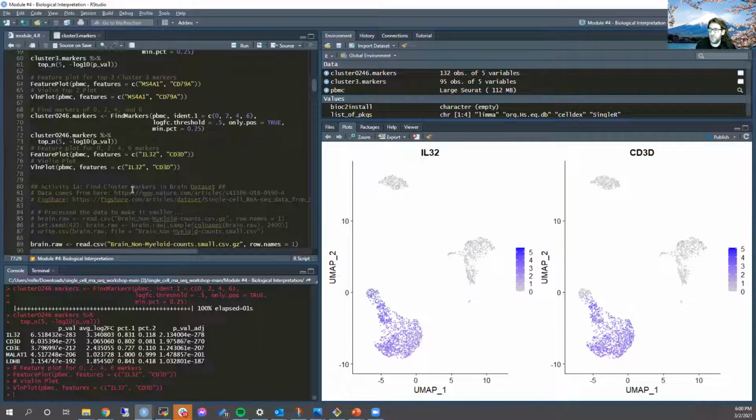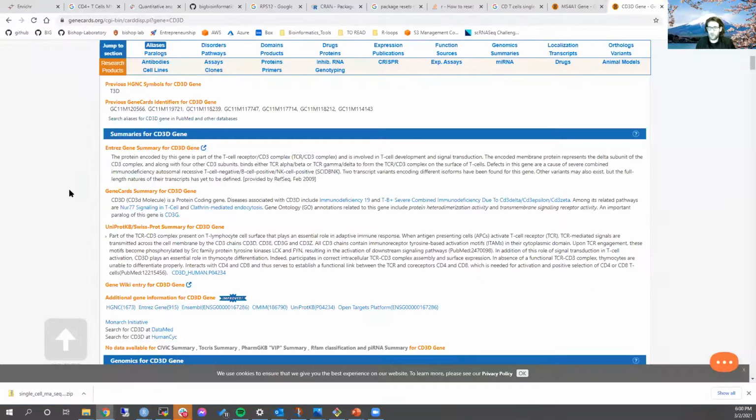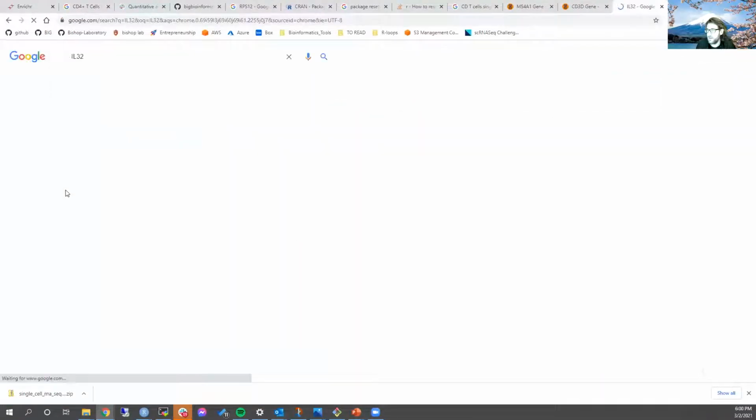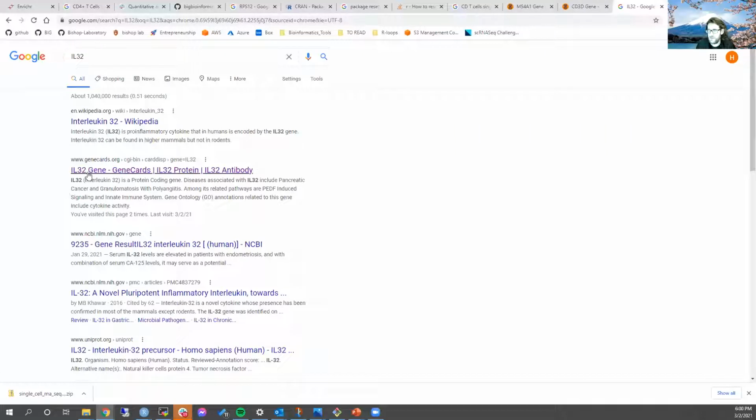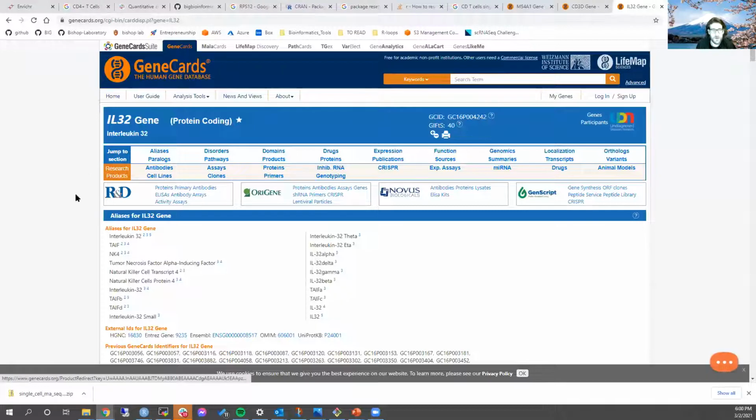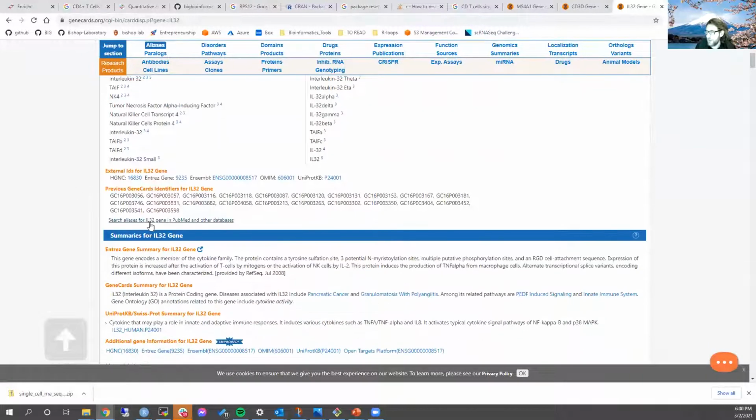So okay, I'm going to slowly move to my browser. If anyone else wants to chime in while I'm doing this. Okay, I'm seeing a couple people saying NK. Okay, I'm seeing quite a few people saying NK.